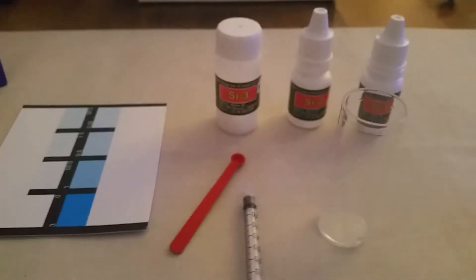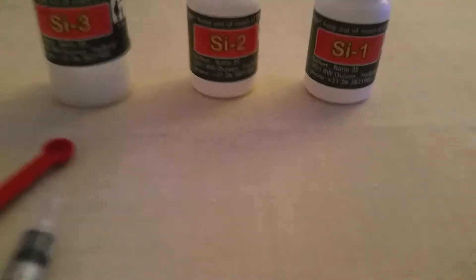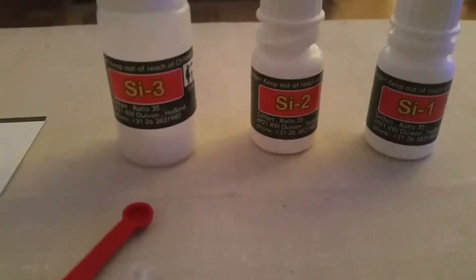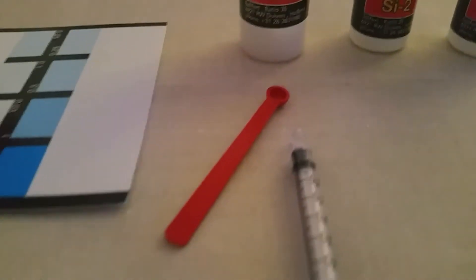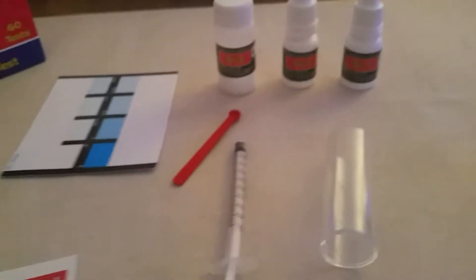So let's see what's in the box. You get three agents: SI1, SI2, and SI3, a little pipette syringe, a colour chart pot, and the instructions.